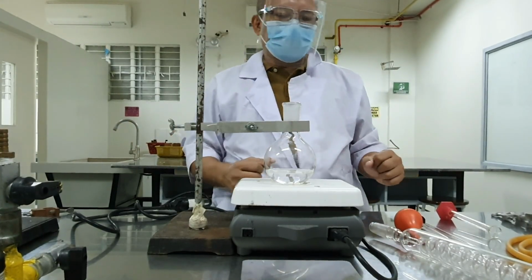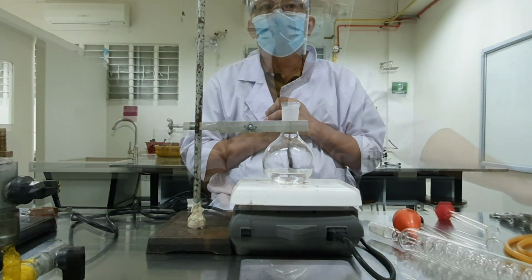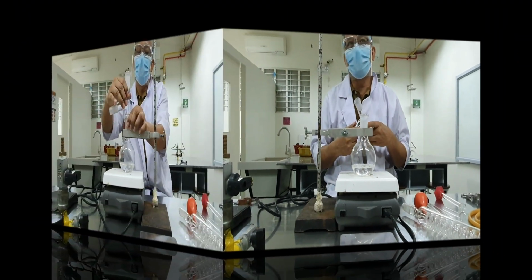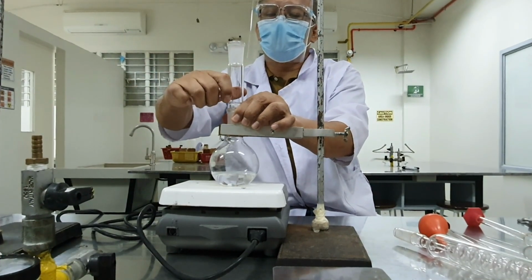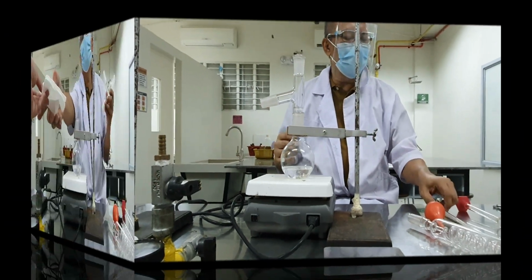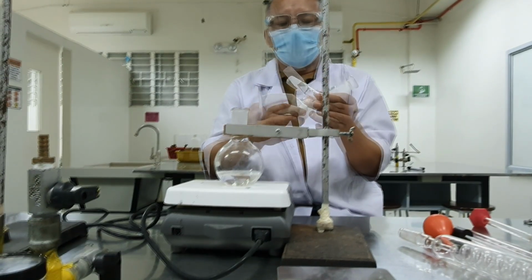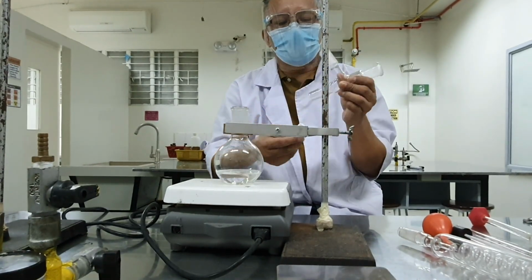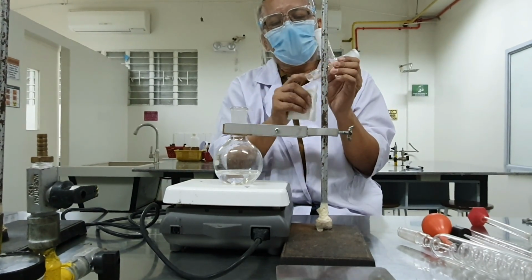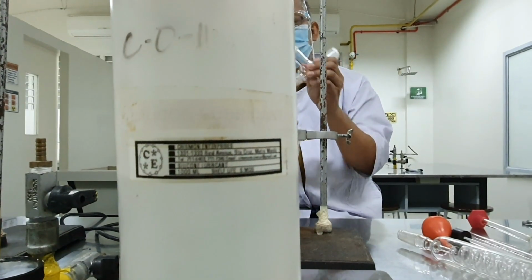Okay, that's it. And we're going to connect the adapter. We have to be close to the sink. So this is our adapter, and our thermometer. To prevent sticking of each component of the distilling apparatus flask, we add a lubricant, silicone.